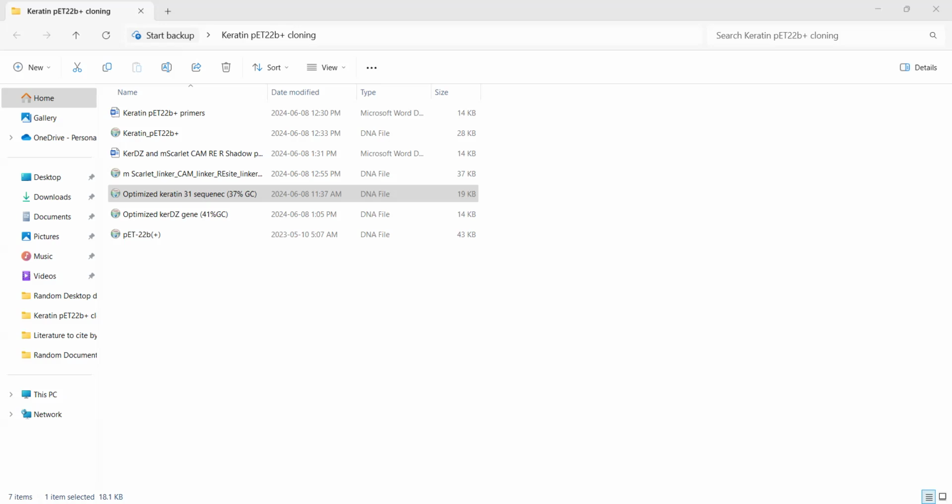So I will go to Control C and then to the reverse complement, because for the reverse primer, you have to do reverse complement, and you will click and copy. Now, if you go to the TM calculator, we can see that these two are perfectly matching. Again, this is ideal because we know how it will work. We already did this on that.